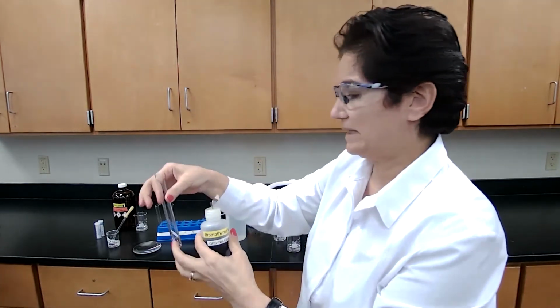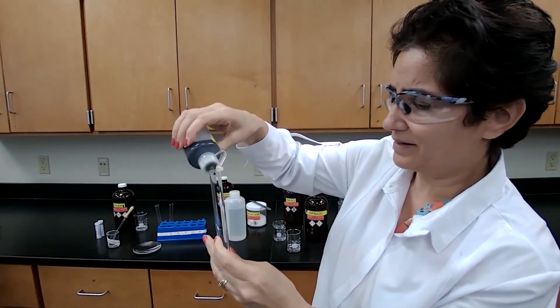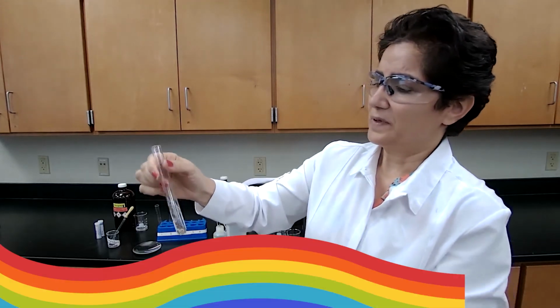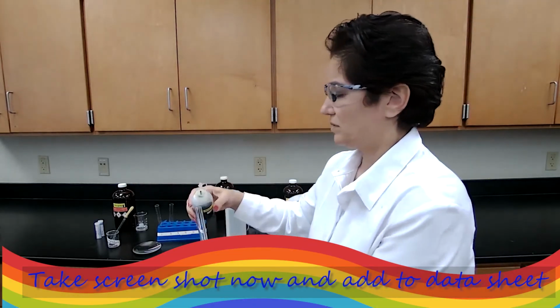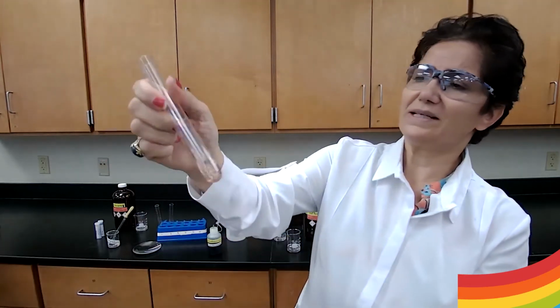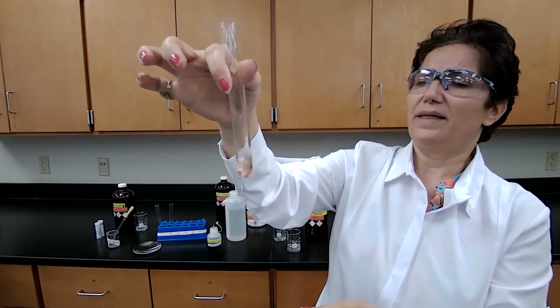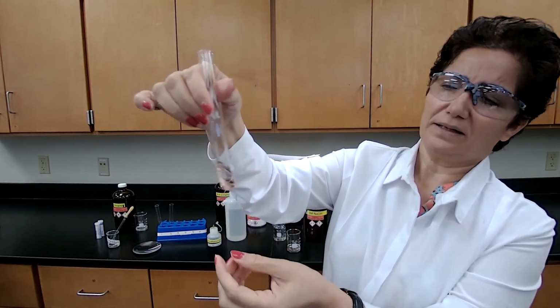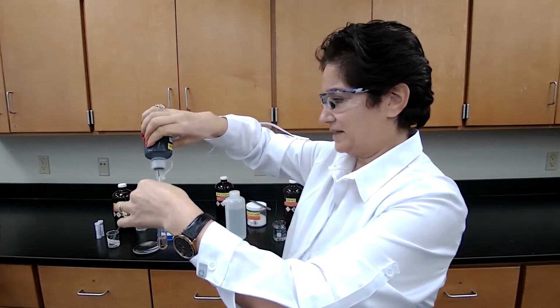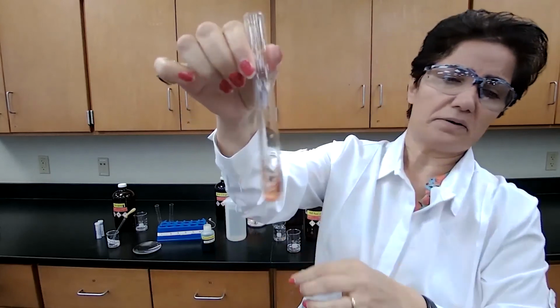Next solvent is HCl. This time I'm going to add the acid-base indicator to show you that the layers are more distinct. It's easier for you to see it. So this is just a layer of HCl. And now I'm going to add the unknown. So when I add unknown, let's see if I can make it slightly darker for you. Okay, it's easier to see now.